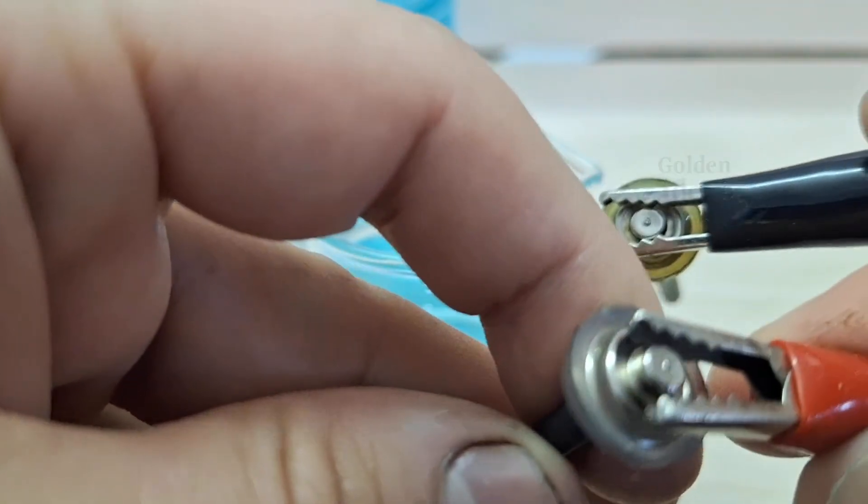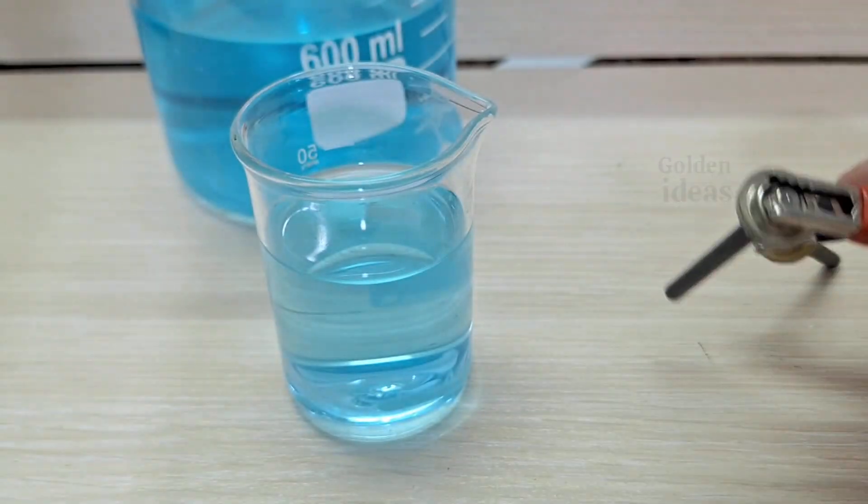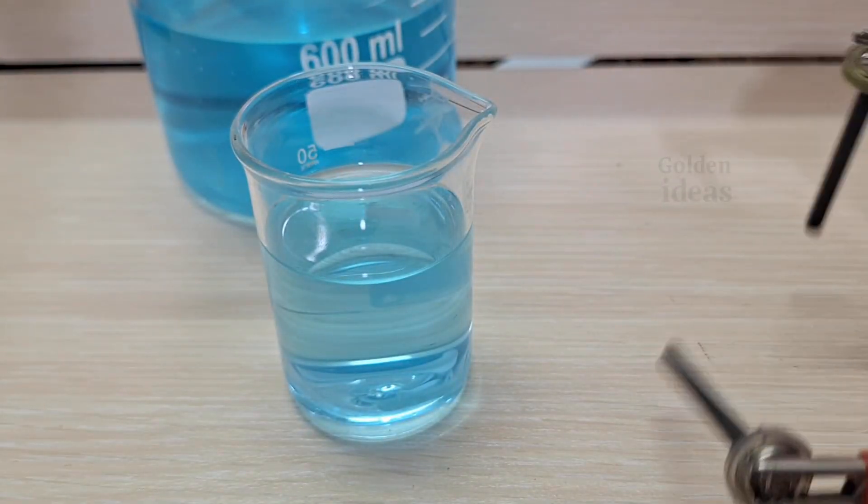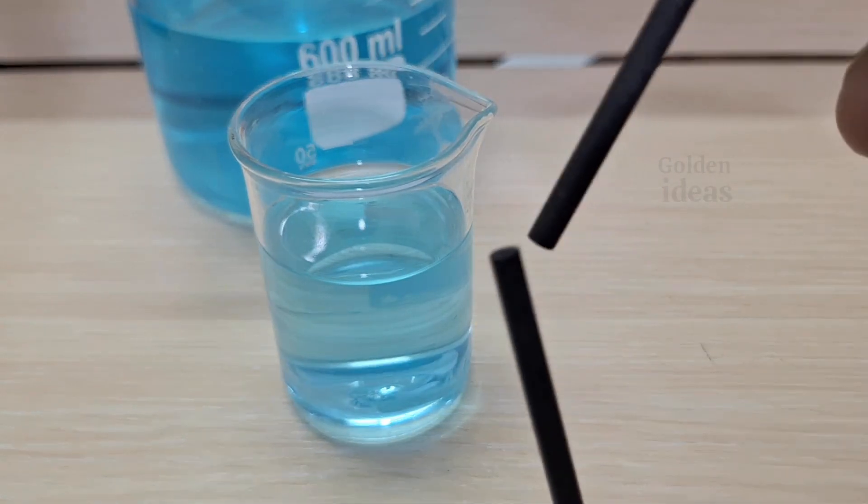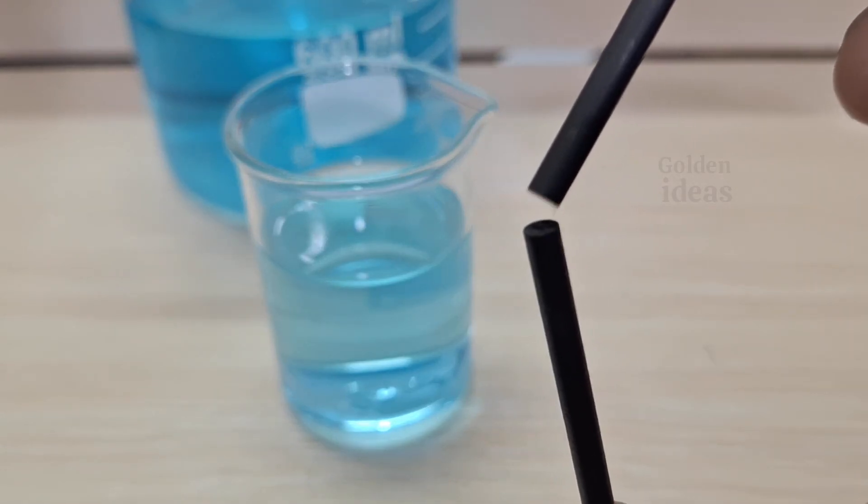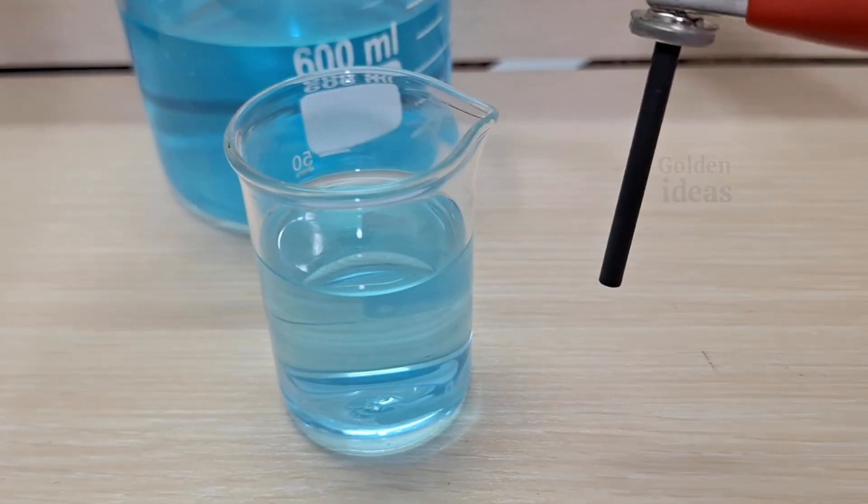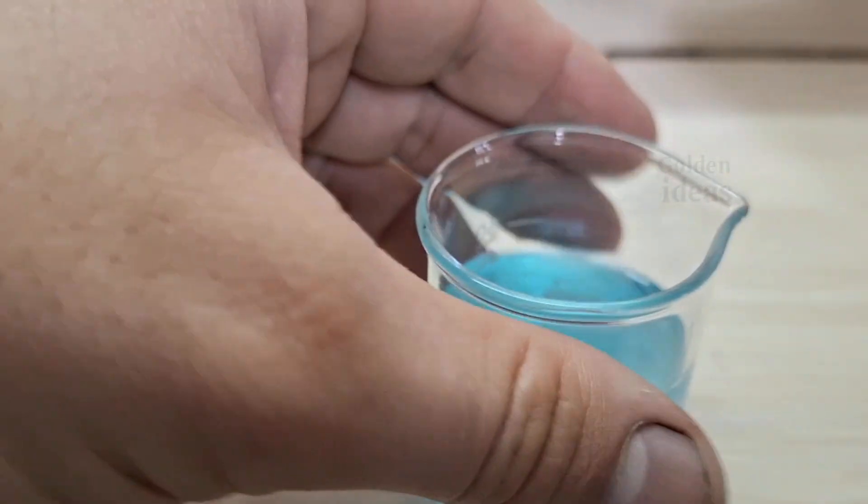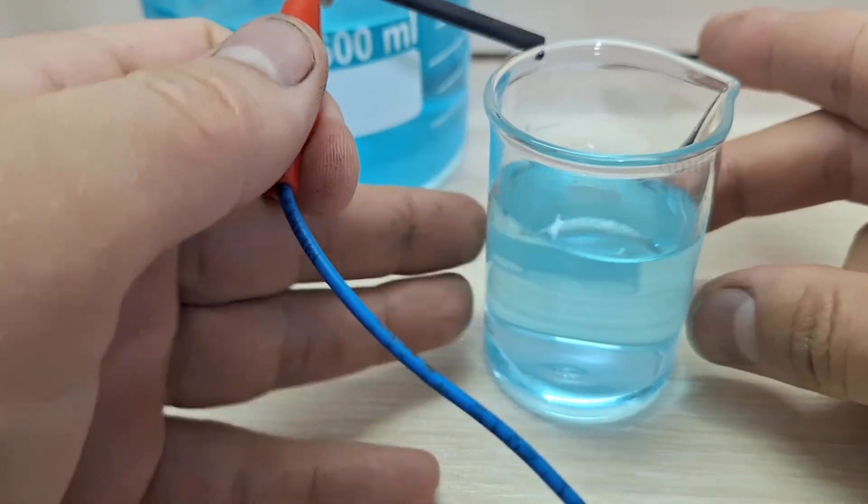Now I need to place the electrodes on opposite sides of the beaker, making sure they don't touch each other. You can also use other types of containers instead of a beaker, as long as the container is resistant to both heat and acid. That's important because electrolysis can generate a significant amount of heat. The chloride solution inside the beaker is acting as the electrolyte, that is, the conductive medium for the electricity.